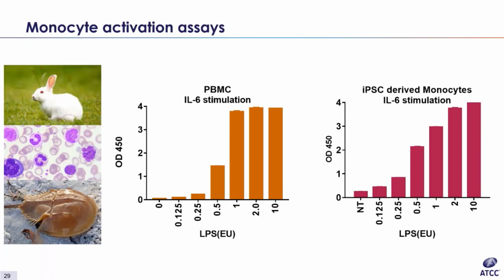So finally, there's the monocyte activation test, or MAT assay, which uses the cryopreserved blood of several human donors. While it's much more humane than the other 2 tests, it could suffer from lot-to-lot differences in quality. So you have influencing factors such as lifestyle and genetic background that can differ significantly between the donors, and really we just can't control for that.